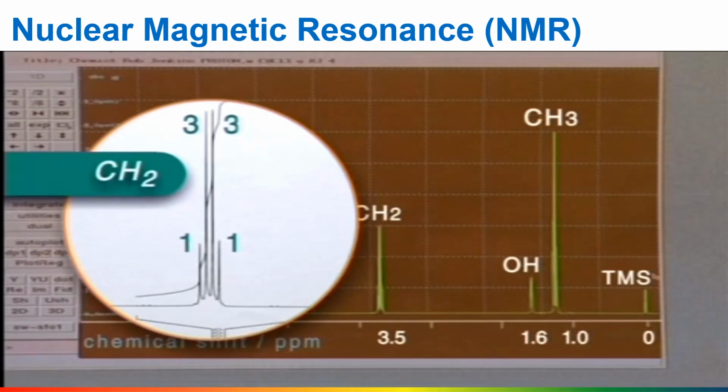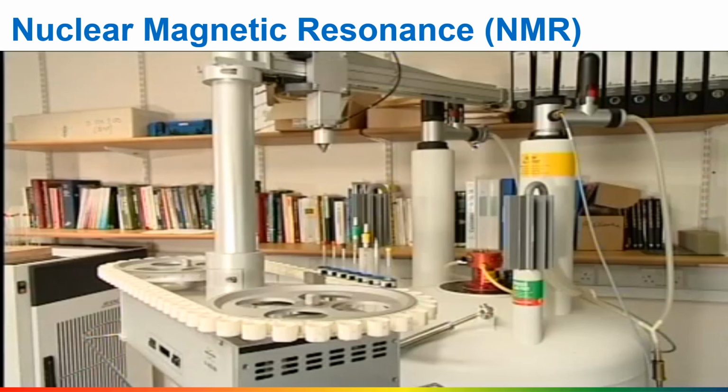Interpreting proton NMR spectra can thus provide a great deal of information about molecular structures. The same instrument can be used for NMR of other magnetic nuclei. A useful one for organic chemists is carbon-13 NMR. All that has to be changed is the frequency of the radio signals.